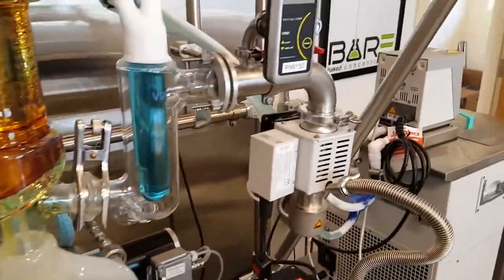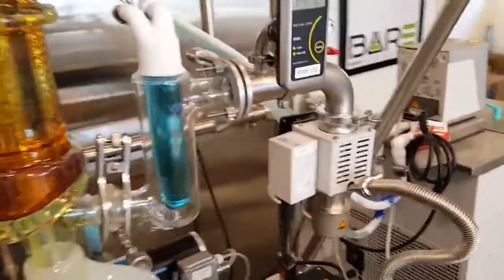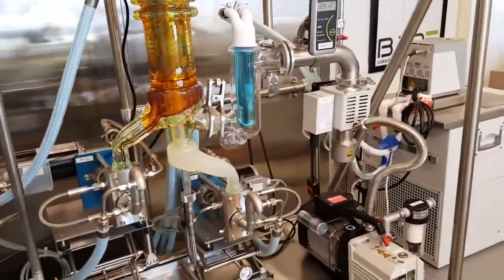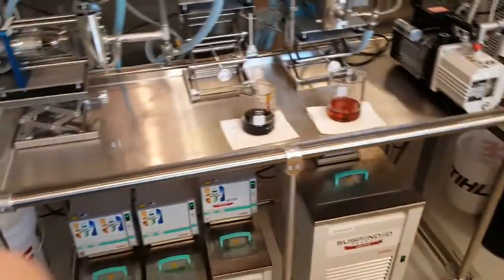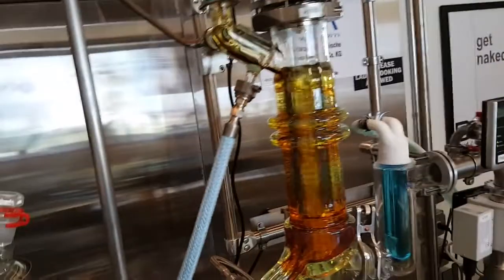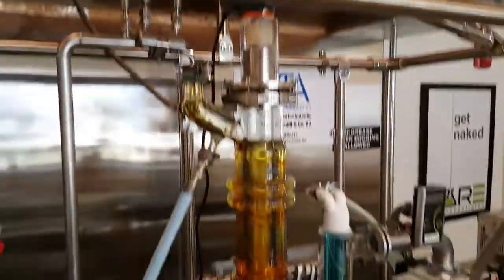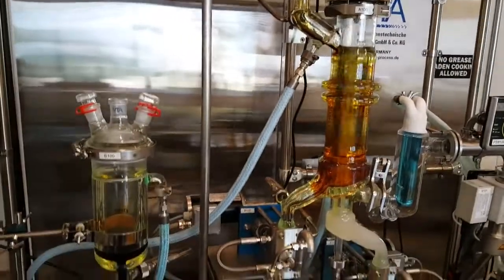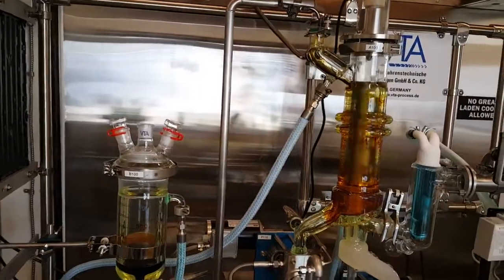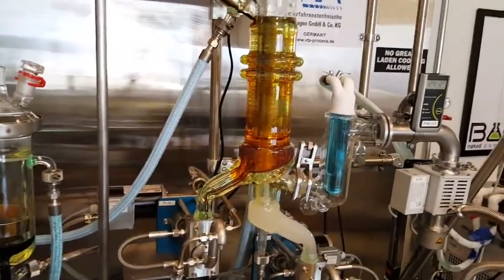Before the pump there's what they call a diffusion pump — my first time ever seeing or hearing about one of those. There's a pump, a chiller, and all these components for maintaining temperatures. Everything's got a jacket around it. Hopefully someone who knows more than me will answer questions in the comments.